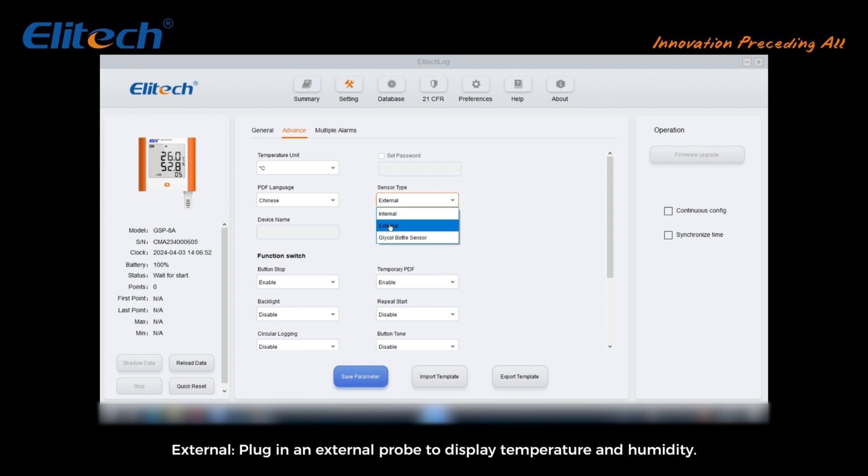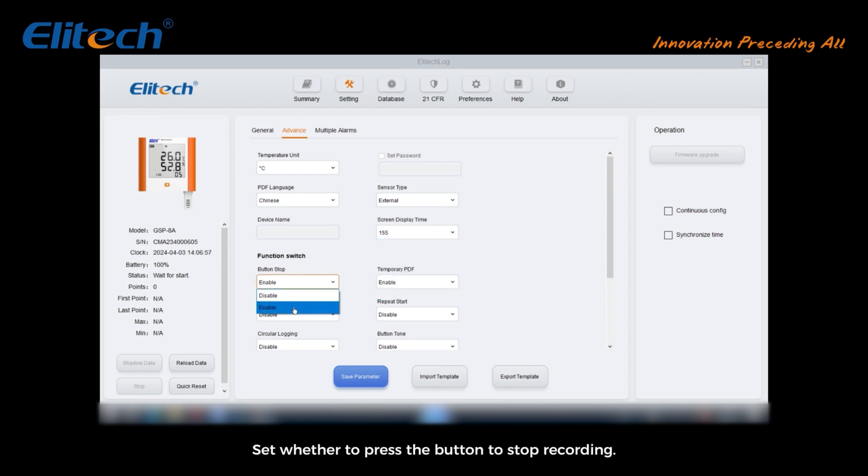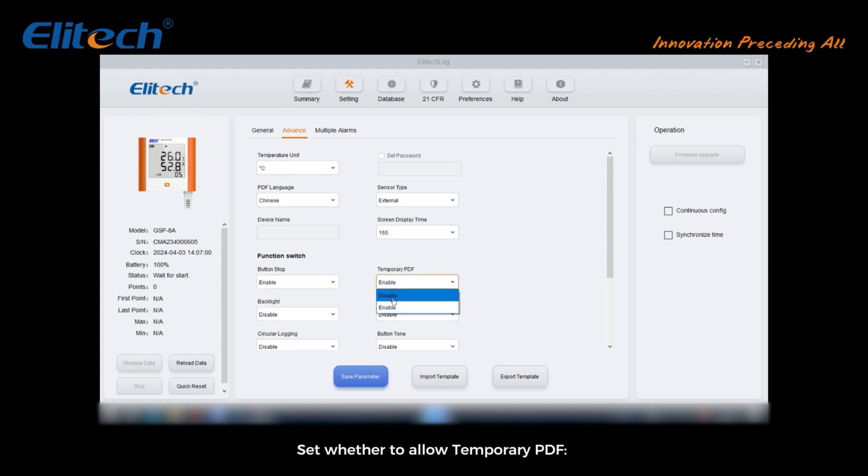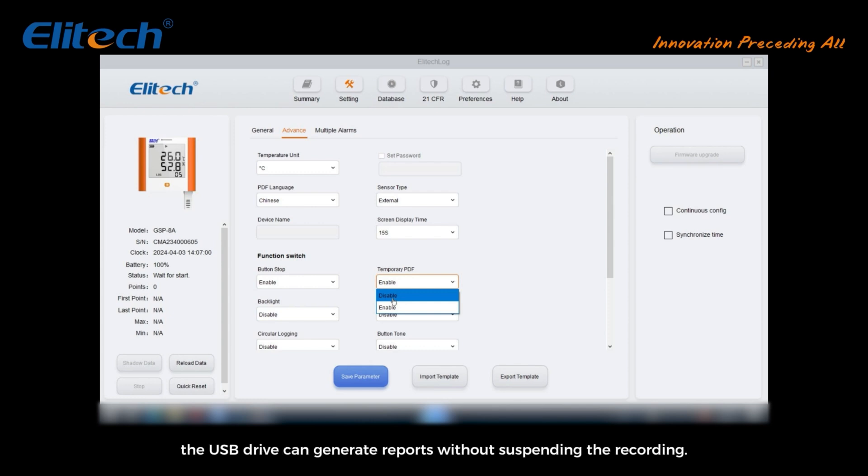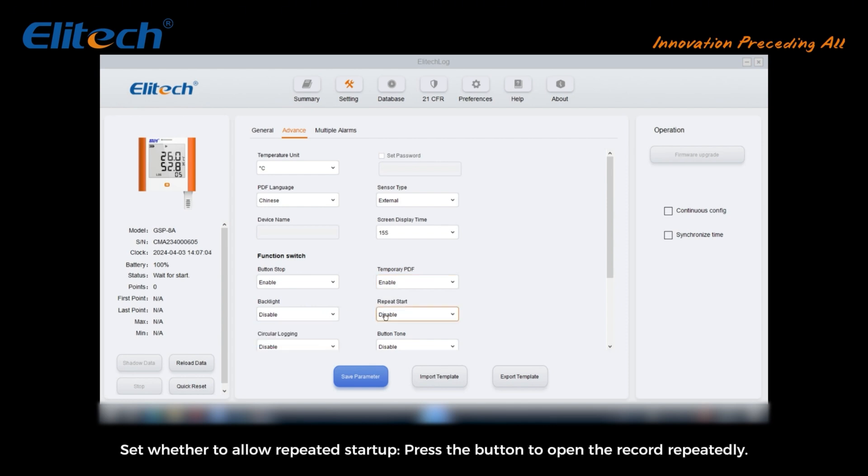Set screen display time: set the on-screen time as required. Set whether to press the button to stop recording. Set whether to allow temporary PDF when the device is plugged into the computer during the recording process. The USB drive can generate reports without suspending the recording. Set whether to allow backlights. Set whether to allow repeated startup: press the button to open the record repeatedly.